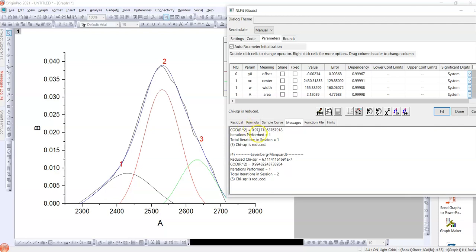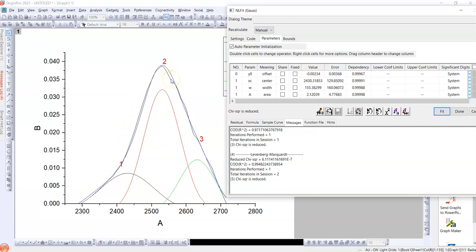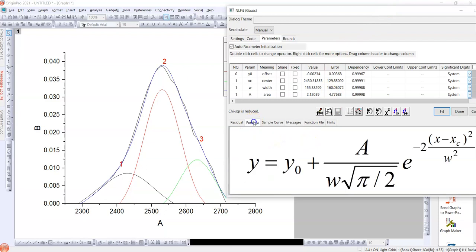We can see from this spectra is a good convergence of the cumulative peak with the black one, that is the original data from the FTIR data of water. Besides that, some other formulas are there. This formula has been utilized for Gaussian deconvolution of this spectra.